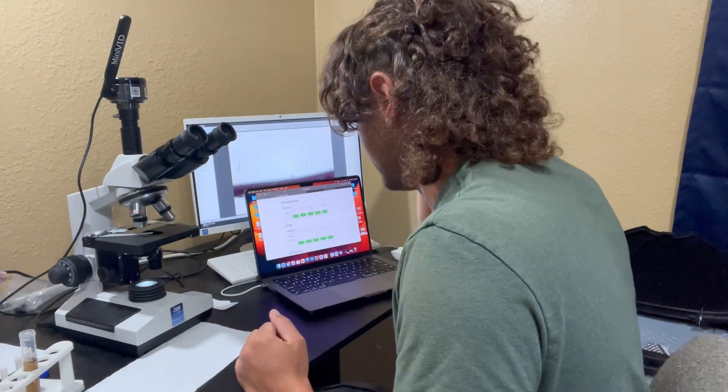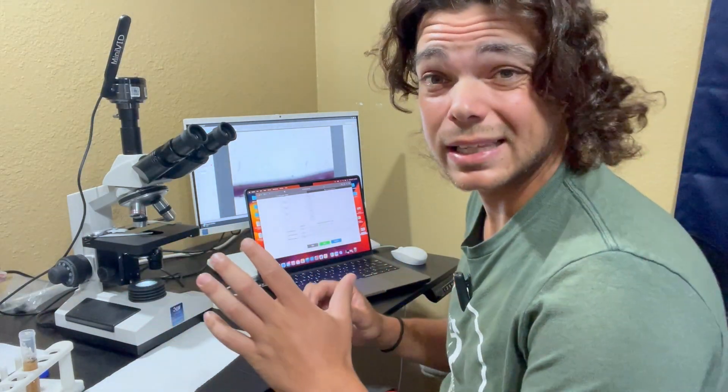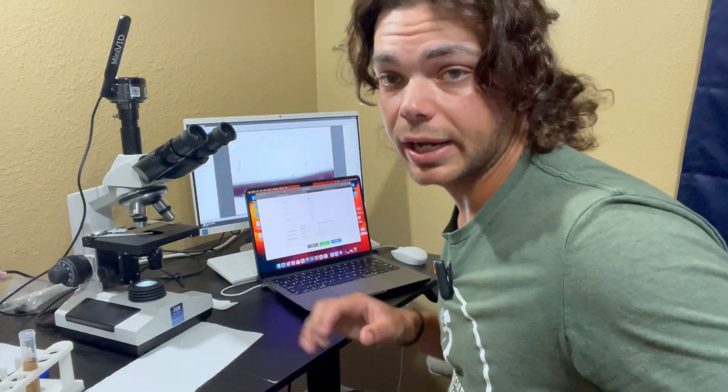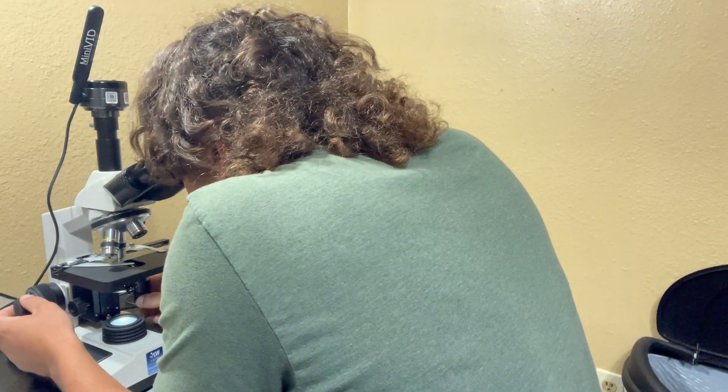Now I'm going to do my first field of view, testing for everything but bacteria — actinobacteria, fungi, oomycetes, protozoa — and bacteria at the end since I'll have to change the dilution. That little brown guy right there is a very juvenile fungi, basically in the middle of growing, and he has new growth on the tip — that's a good sign. Up in that top corner there is another beneficial fungi with clear septa walls. And there's an amoeba just off to the right of it — another good guy. That amoeba in the top right-hand corner is filled with bacteria, so you know he's been eating a lot.